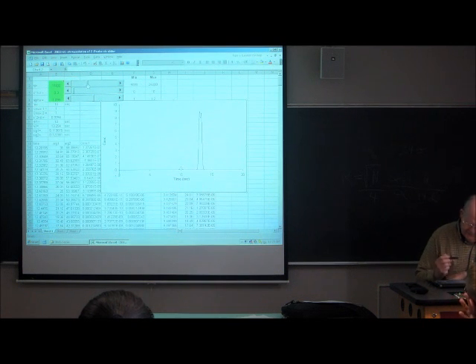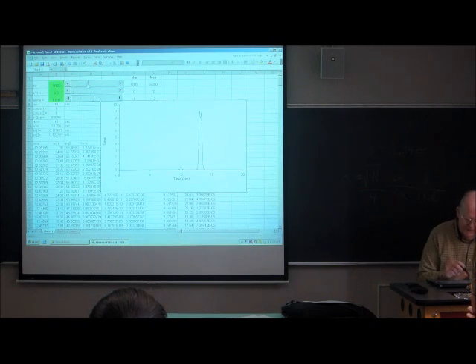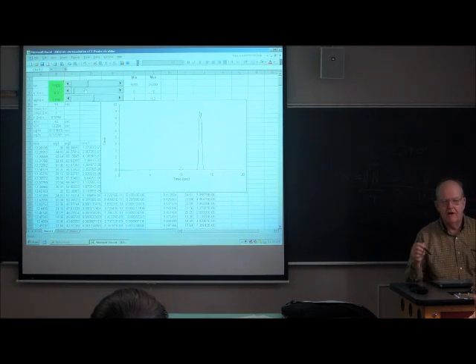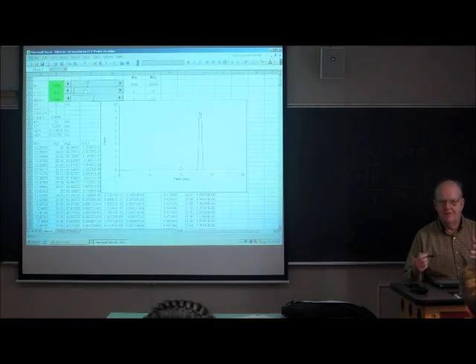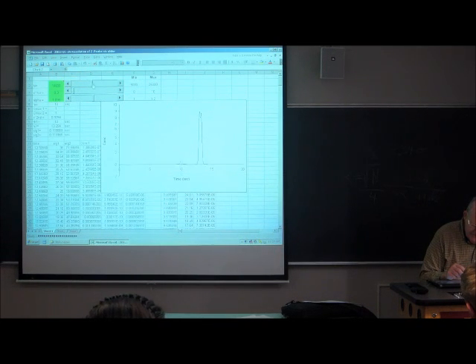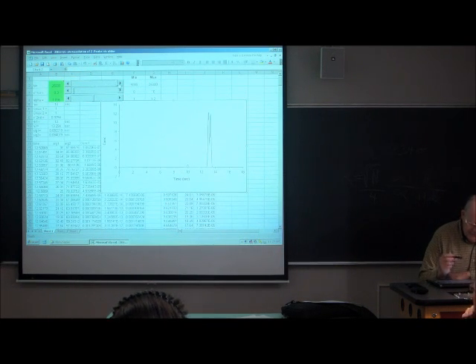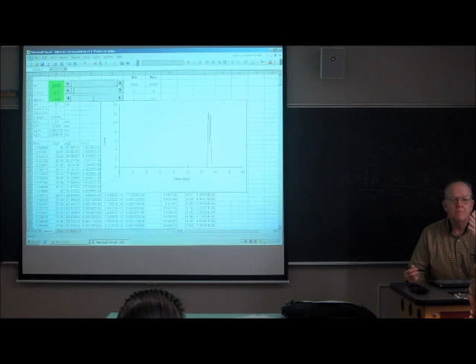So I'm going to increase the plate count. I just increased the plate count from 5,000 to 11,800. That's a big increase in plate count. I'm not changing the column length. I'm waving a magic wand over the column, and the plate count's increasing. And then if we run it all the way up to the limit, 25,000, that's all you can get. That's the best you can do.